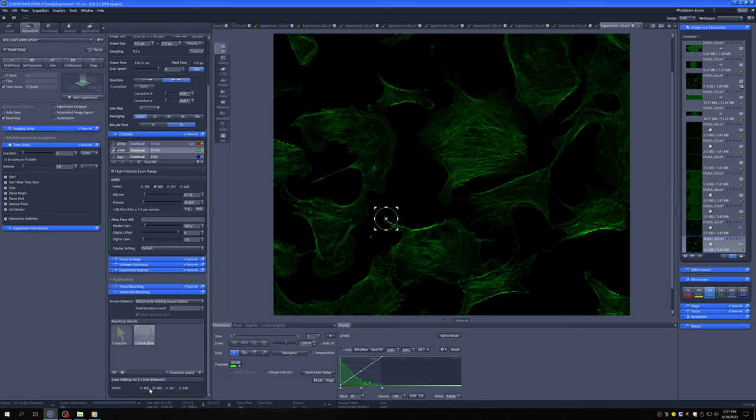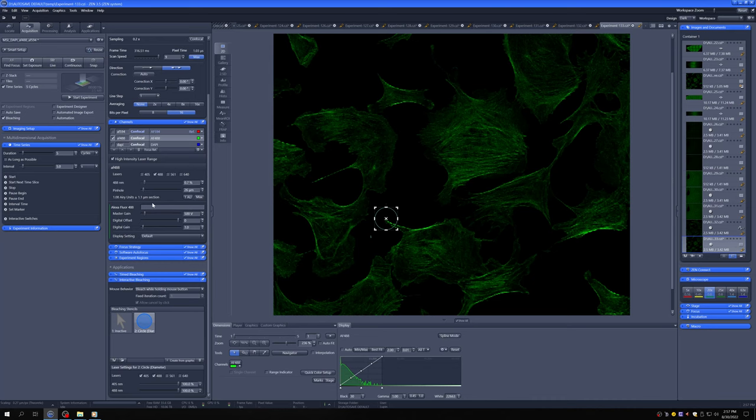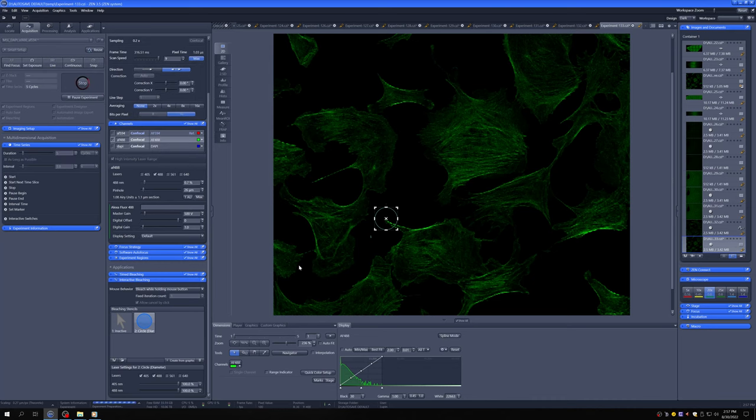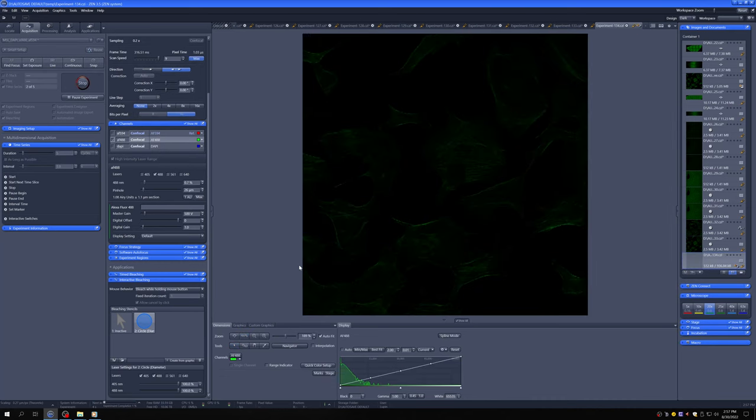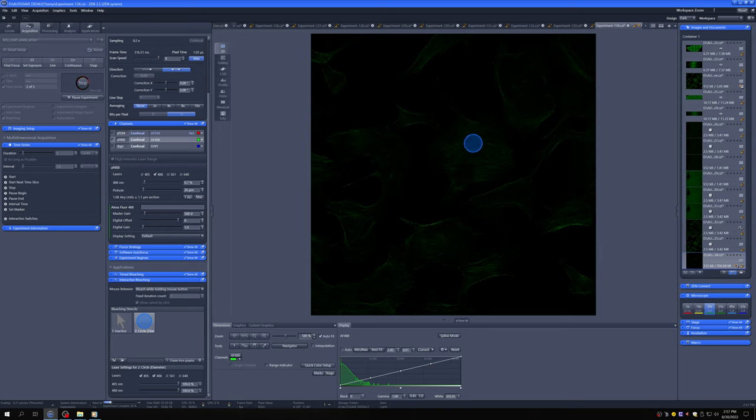And then we're going to bleach with the 405 and the 488 at maximum power. So now if we say start experiment and we have this tool, we can bleach at will wherever we want.